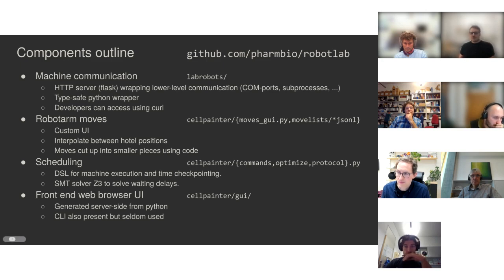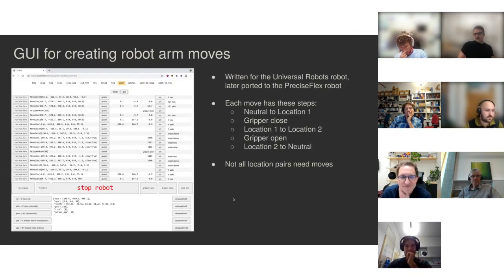And then the end user also needs to be able to start the whole system. So we saw before where the user queued up some plates for the imager and pressed start. So we need a user interface like that too. Of course, in the beginning there was just a command line interface, but our operators weren't very happy to use that.